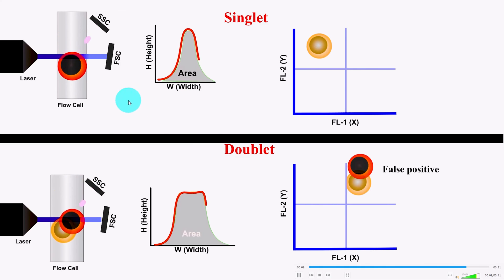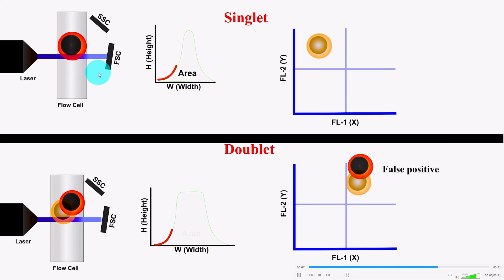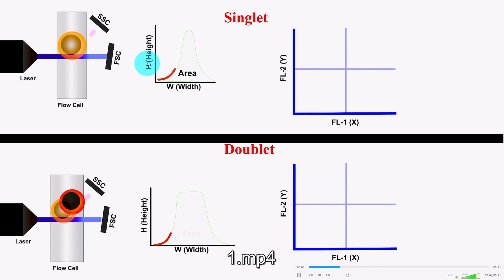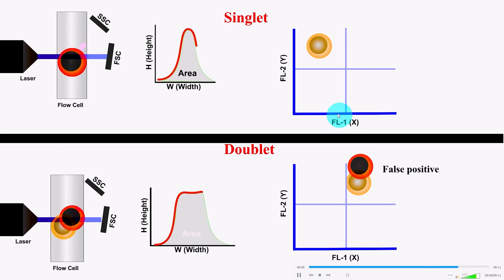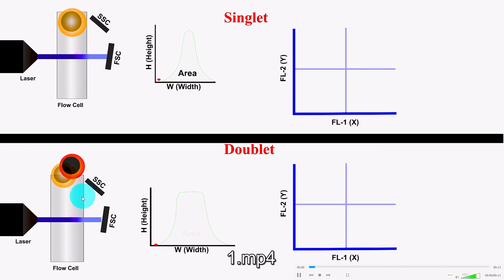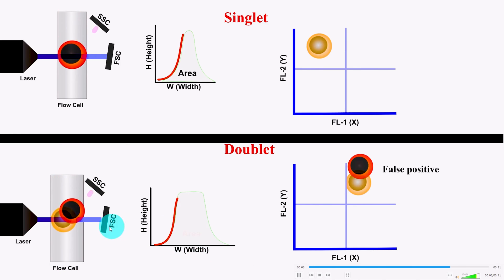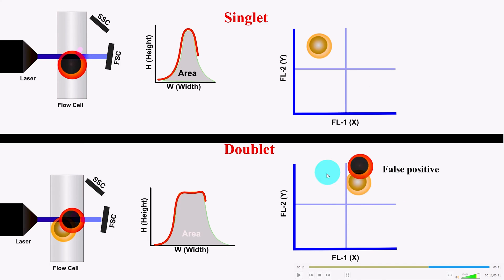Now I'm going to show singlet and doublet cells in animation — what happens when they pass through the flow cell. In the case of a single cell, you can see the signal detected by SSC and FSC, and the plot of height, width, and area. Cells are plotted FL1 versus FL2, showing cells positive for each marker. But when cells are aggregated, both cells pass through the flow cell together, the area, height, and width all change, and the cells appear double-positive — not because they truly are, but due to the aggregate. That's why it is very important to remove these doublets from your data analysis.